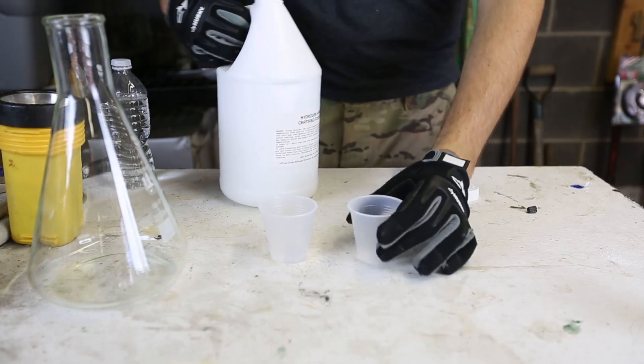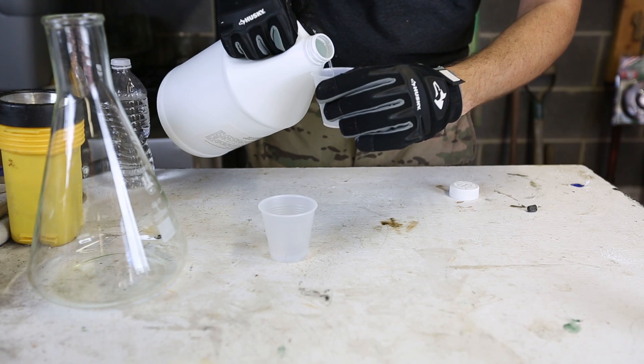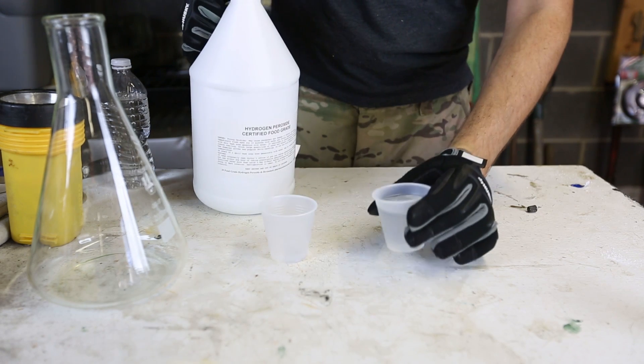All we're going to need is 35% hydrogen peroxide and potassium iodide. First, we're going to get hydrogen peroxide, 35%, and fill up a glass, just like this.